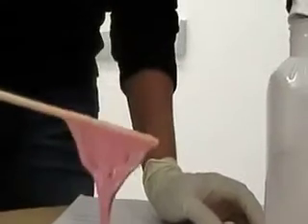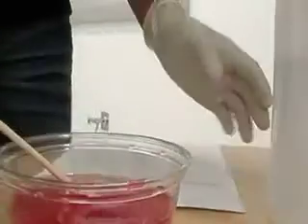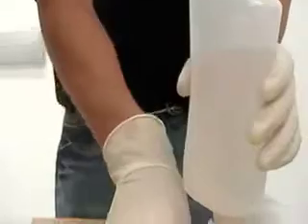That's a lot of DNA. And Ron can go ahead and he can do the exact same thing with the peaches.